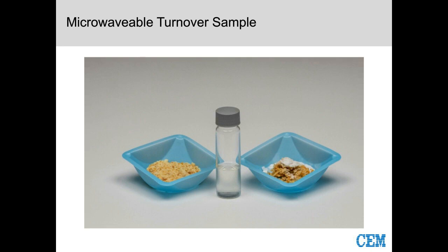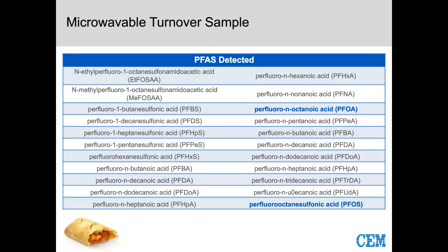So then if we look at the data here, maybe not surprisingly, even more PFAS. So a lot of hits for this particular sample.